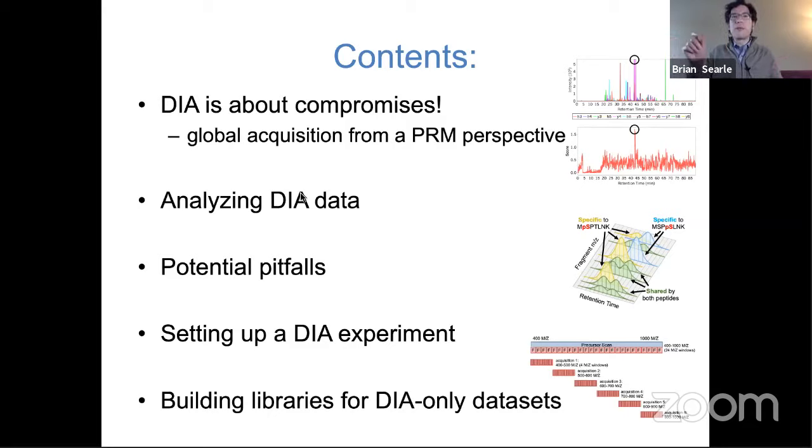So oftentimes we end up being able to see no precursor signal because there's a huge other ion present at that same time point in the precursors. But in the fragment ion scans, we actually see really good fragment ion peaks because we are selecting out only fragment ions that are associated with this narrow precursor peak in the range that we're interested in, 500 to 525 or something like that.